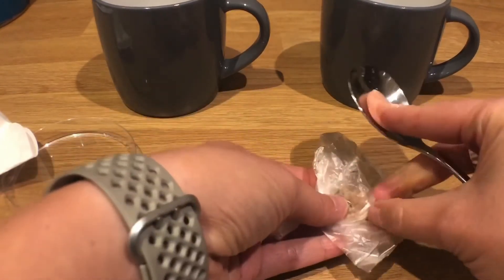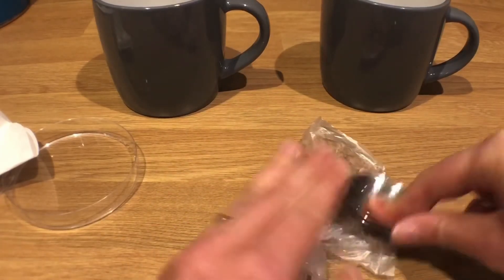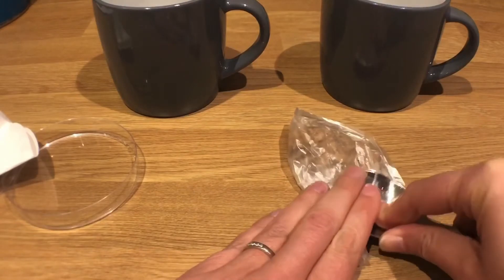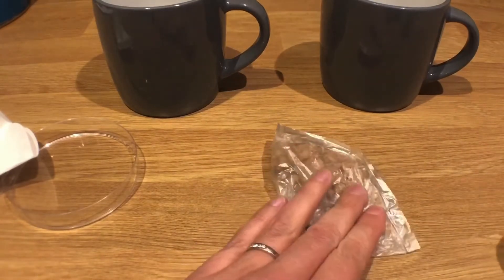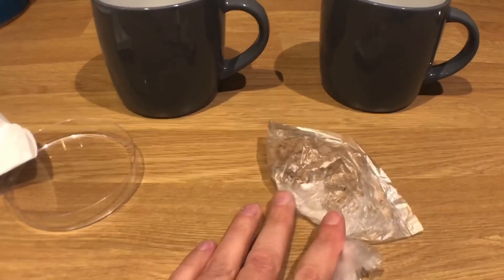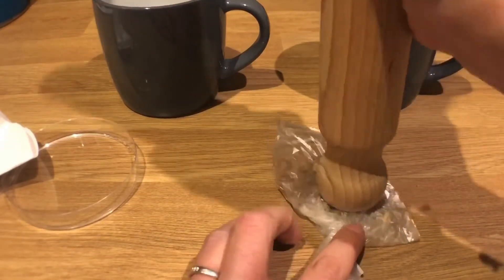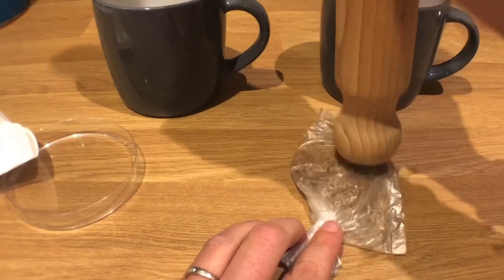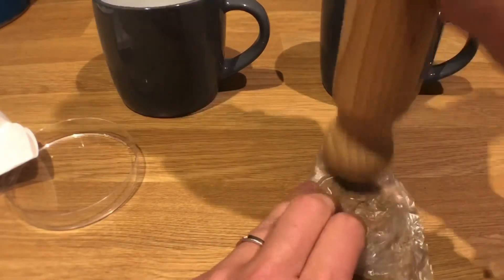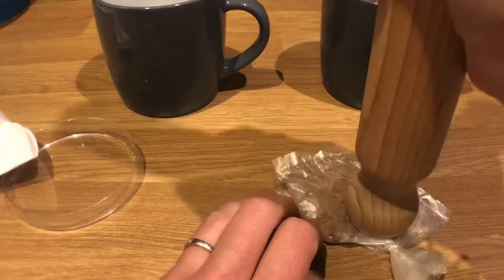I might suggest using a better bag than this one — this bag is quite thin. If I do this too much I'm actually going to split the bag and just end up making a mess. So work out what's going to be best for you to crush your salt. A rolling pin might do the job a bit better, it's a bit like a pestle and mortar — crushing it and increasing that surface area.